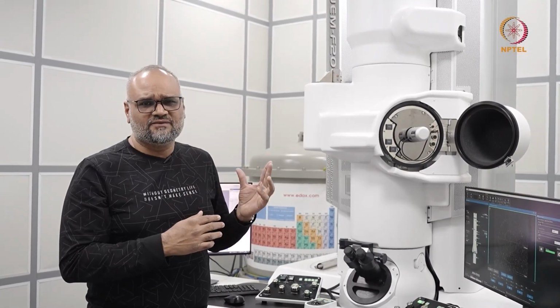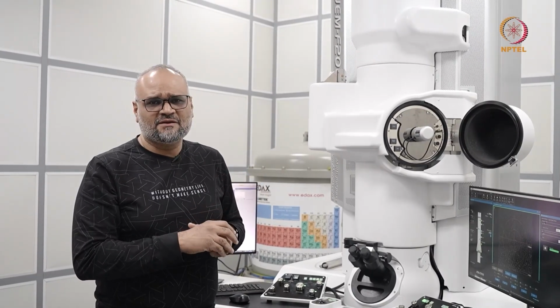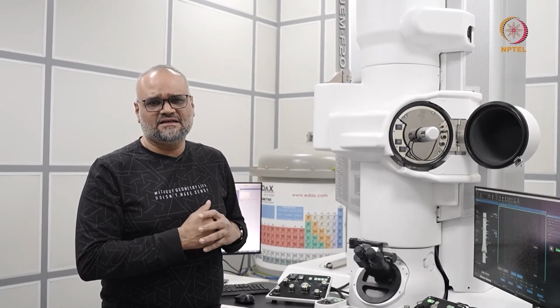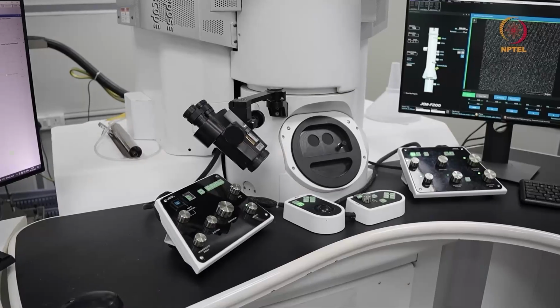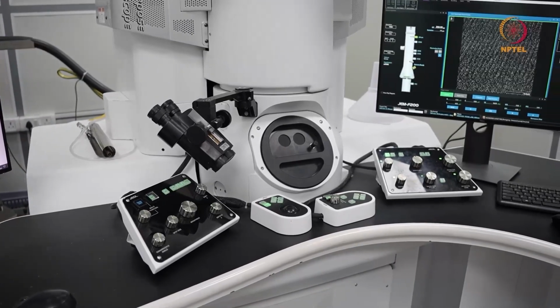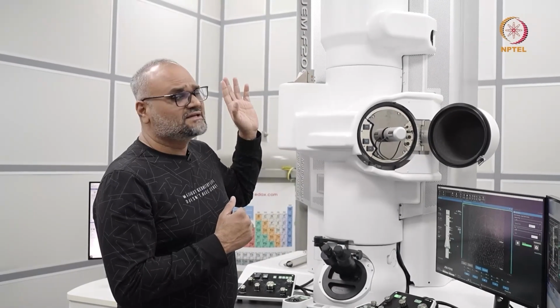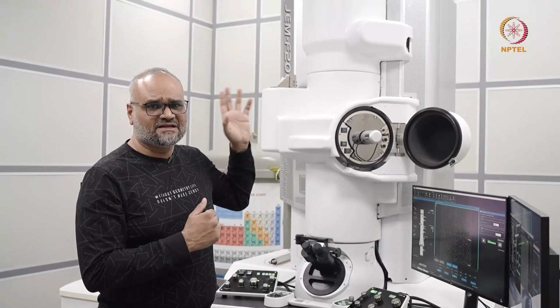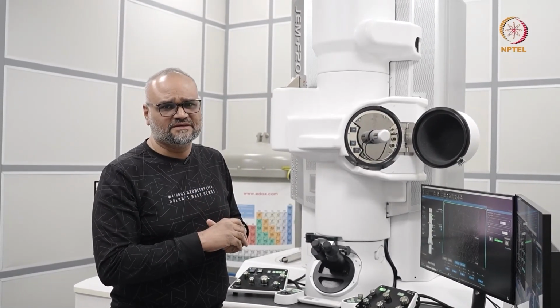Although the stability of a cold field emitter is much lesser than a thermionic emitter, or in comparison with a Schottky emitter, the stability is not as good. You can actually do multiple rounds of flashing through the day and then still keep the instrument running. The advantage is the FEG, the gun assembly, the FEG itself has a significantly longer lifetime than a Schottky FEG.